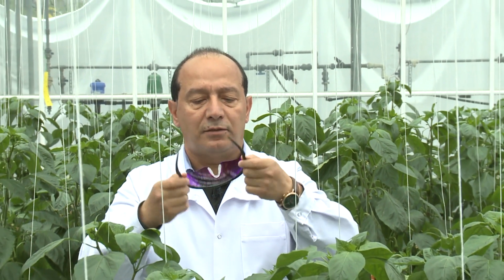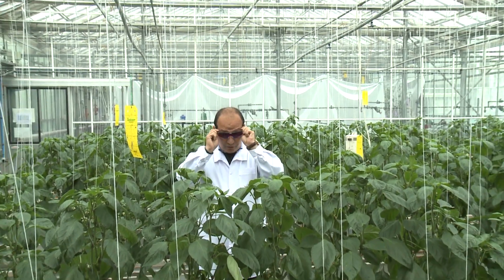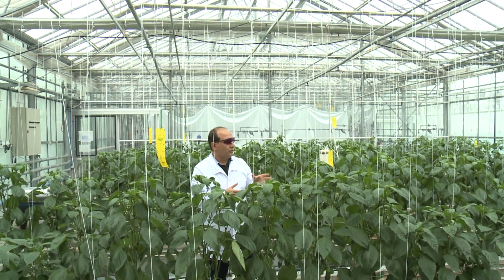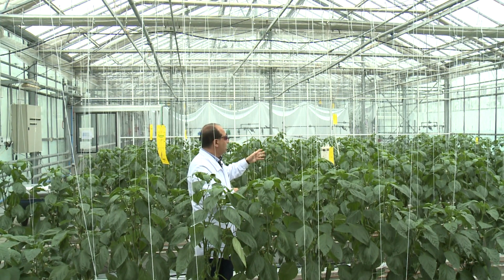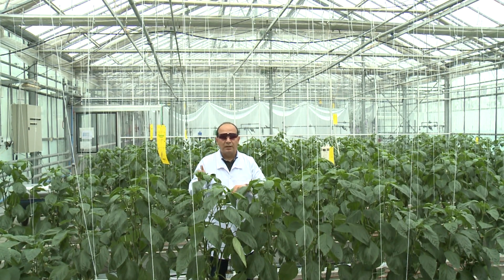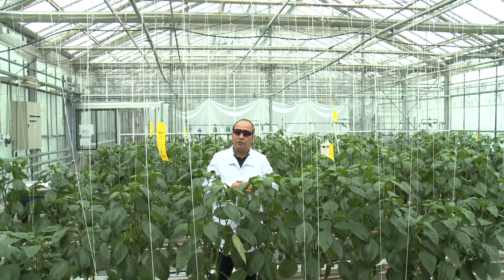At the end of this presentation, I would like to show you these very nice products from NASA that could be used by any farmer or scientist for very fast detection of any stress which can affect our plant growth. It's enough to put on these glasses and go to the field, to the forest, or in the greenhouse, and we can see the plants that are affected by any type of stress in a different color than those which are in optimal conditions and good physiological status.